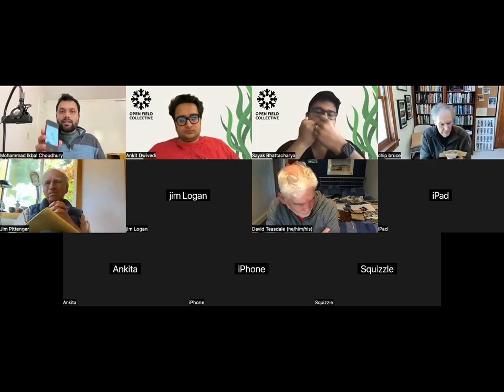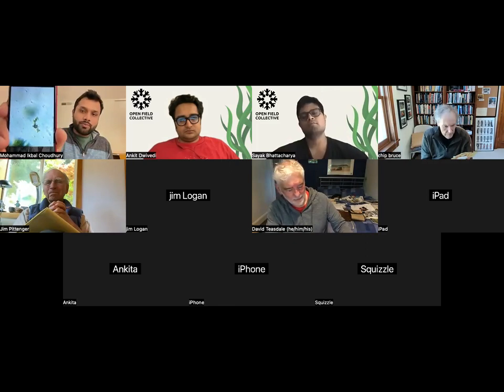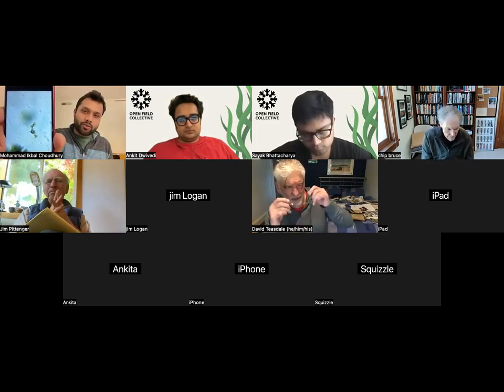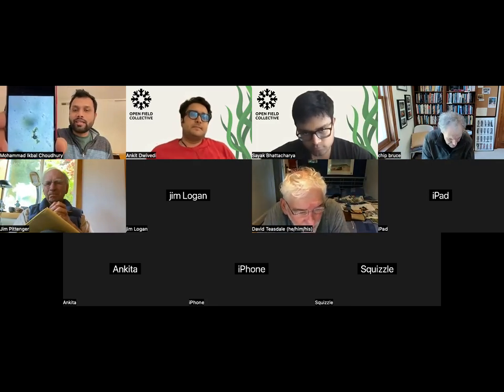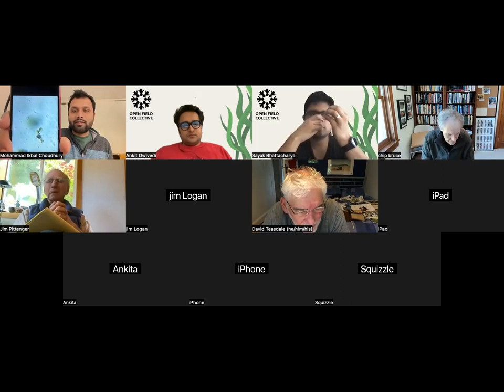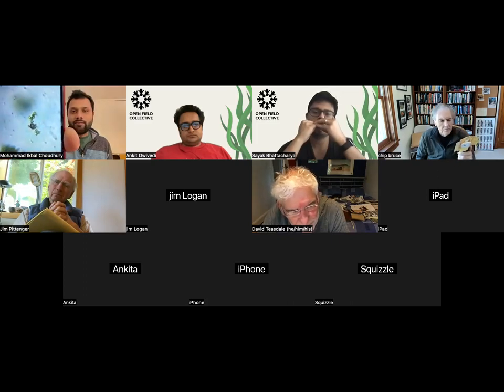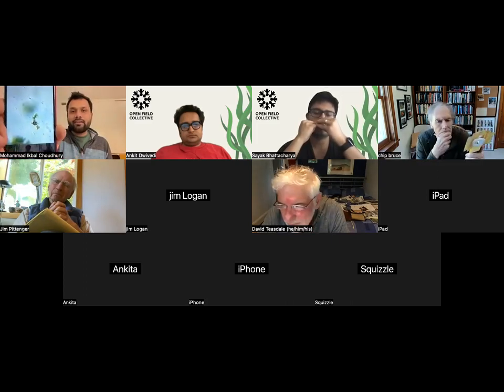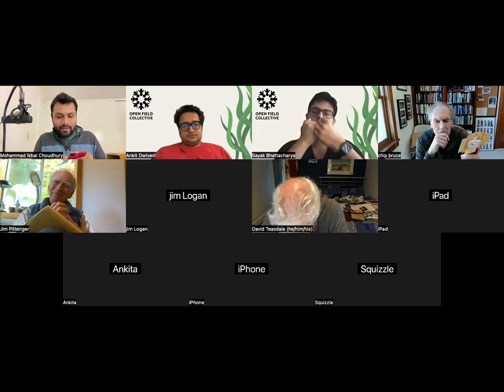Yeah. So once you can get a good image like that, you see, I did digital zoom on my phone and I was able to focus on a few algae. So this is a very tiny algae. Usually when you take a sample, you will see much bigger stuff, filamentous algae and so on. These are most likely single-celled. So it takes a while. It took me a while to actually visualize it and give you this picture, right? But then it's good. This is the difficult sample. So the easy one will be easier.